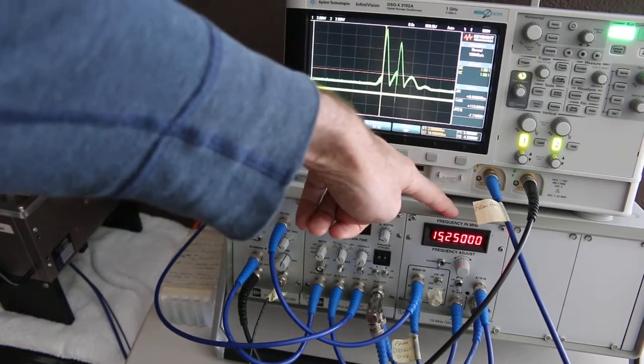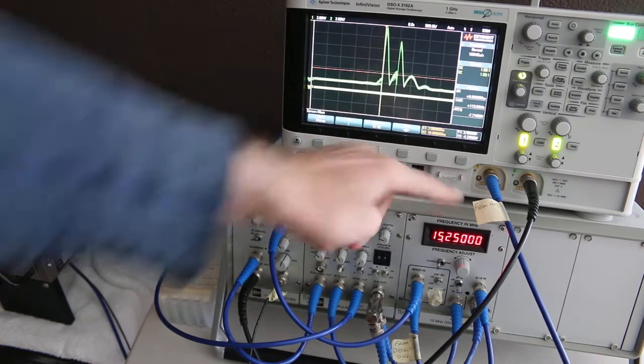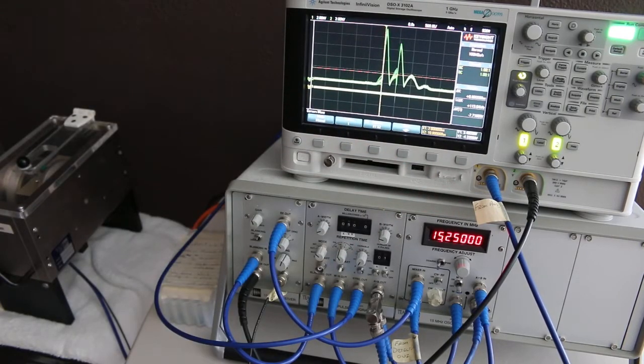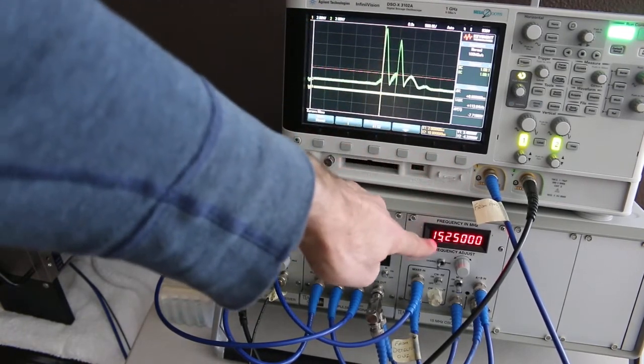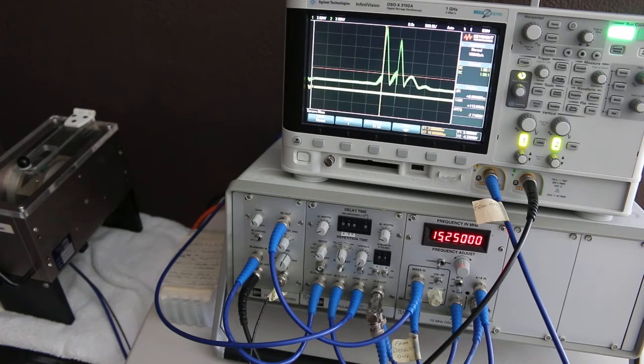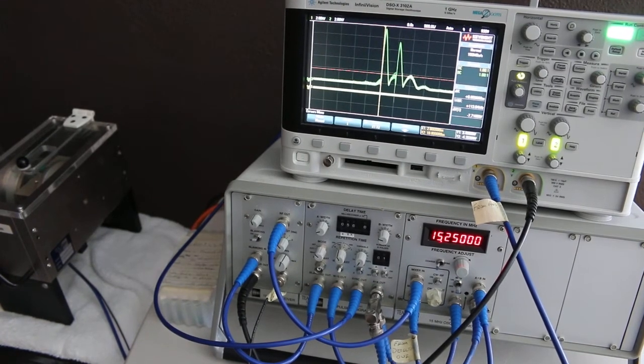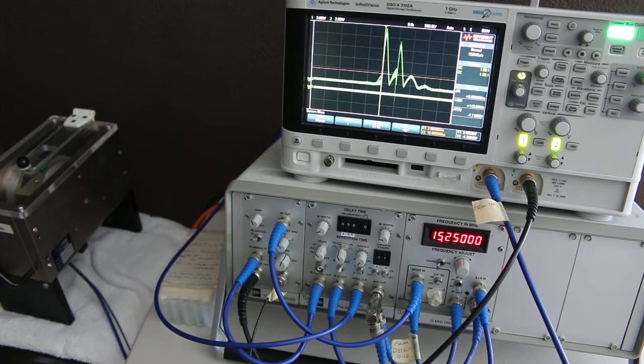The third part over here is a 15 megahertz oscillator amplifier and mixer. So being a 15 megahertz oscillator, it can generate its own frequency. And you can see I have about 15.25 megahertz adjusted on it right here at the moment. So it's putting out a 15.25 megahertz radio frequency.